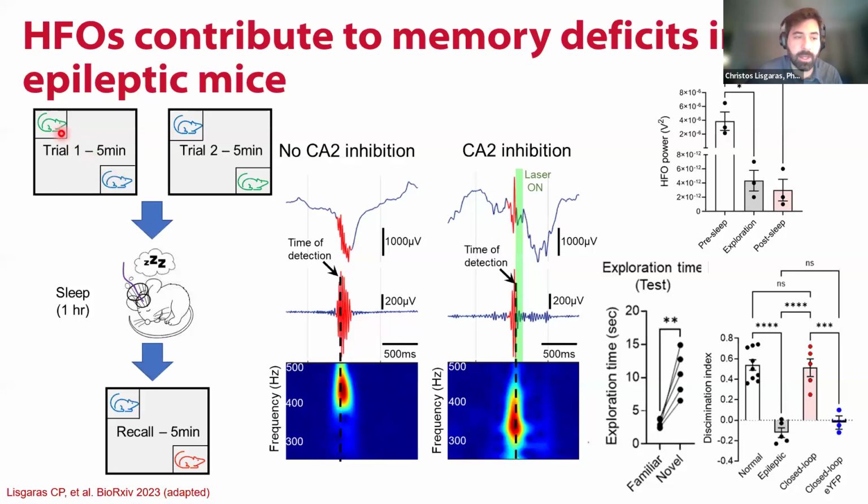We measure the times that the mouse explored either the green mouse or the blue mouse, depicted here. Then we switch the position of those two mice to make sure that they don't have an intrinsic preference to the location or the mouse placed in its location.